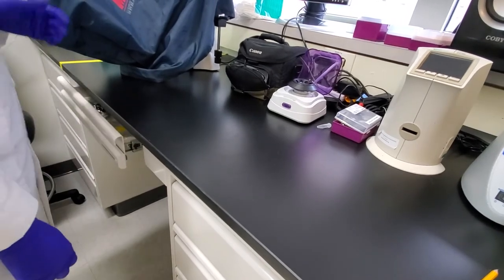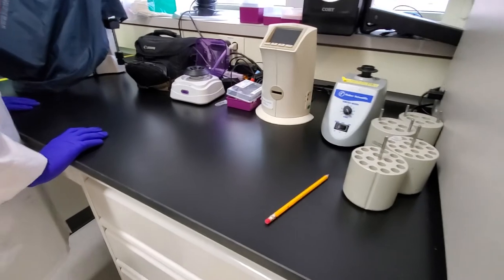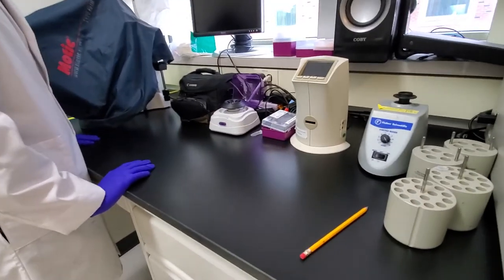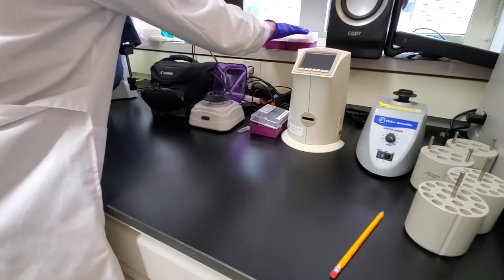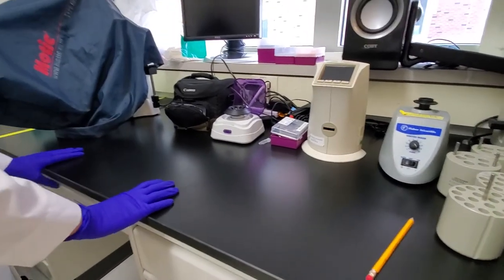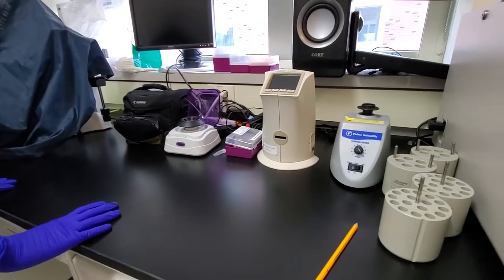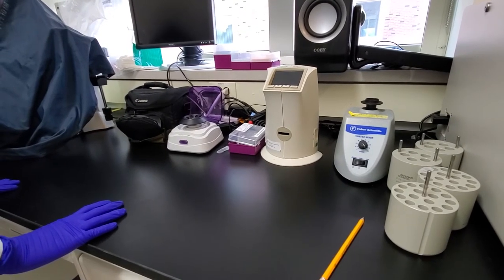Oh, cool. I've heard of these things. I never tried one. You have to calibrate it and check it when starting off with a new cell type, just to make sure it's accurate. And then we have some stocks, some non-sterile pipettes to use for the hemocytometer here if you want to. So you don't have to go in and out of the pipette. Yep. Cool, thank you.